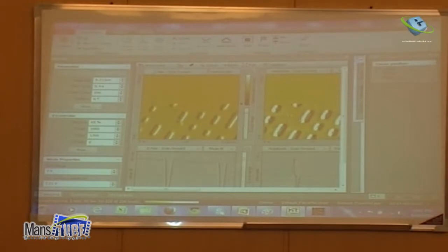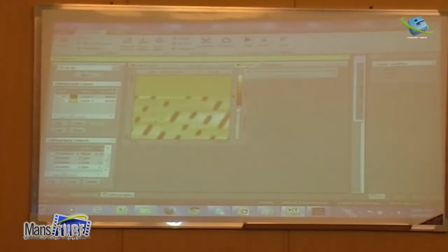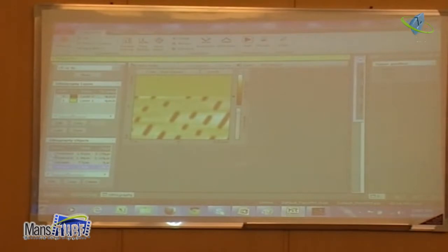Something else we did like this. Okay. I mean, this is, let's say, basic. What we can do is try to scratch something different, more designed. I mean, I can take here, I make load. So, okay. I have the image, and now what I will do, delete, yeah. I mean, I will delete all of this.